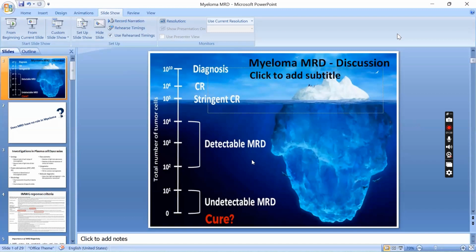So for all MRDs, we have to do bulk lysis to get these events. Yes. For plasma cell MRD, you do bulk lysis, then two washes because we have to do kappa lambda, and then staining like we do for diagnostic plasma cells. Yes, bulk lysis for any MRD. The beauty of bulk lysis is that it gives you a good cell pellet. Second, it removes all your platelets and other things in the plasma, other immunoglobulins, everything.